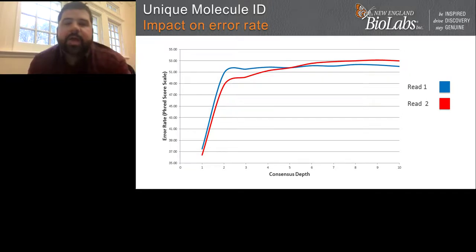So that means that, again, PCR duplicates, or duplicates in general, are a friend as long as we can identify them as PCR duplicates and use them in conjunction with UMIs to do this type of consensus variant calling or error correction. And I do think this is one of the things that will ultimately help target enrichment strategies take it to the next level and be able to look at really low allele fraction variants that might be present in some of these samples. Again, as we push from diagnostic into prognostic type applications, being able to really push the depth of sequencing, push the conversion of those molecules, so we can make sure that the data sets themselves are rich enough that we can derive this really useful information.